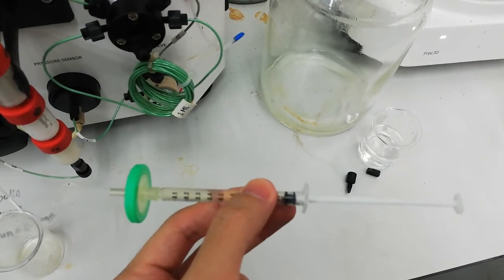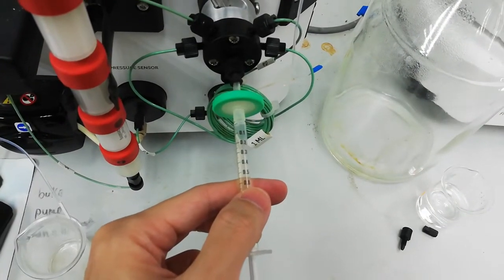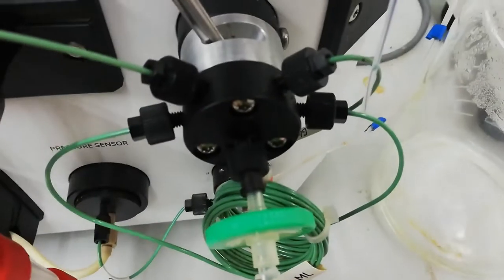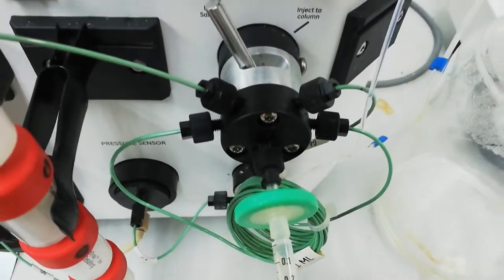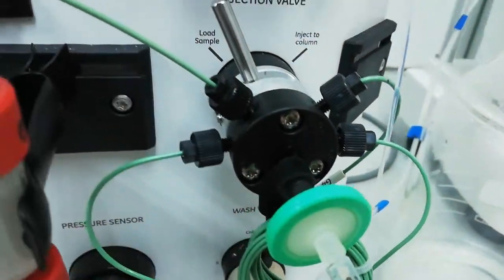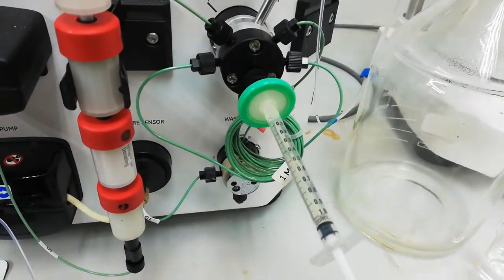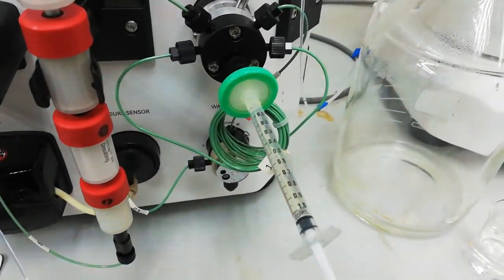Insert the syringe into the injection valve. Before injecting the sample, you need to switch this button from the Load position to the Inject position. Also remember: do not try to push and inject the sample all at once, as it will cause really high pressure which will damage the system.